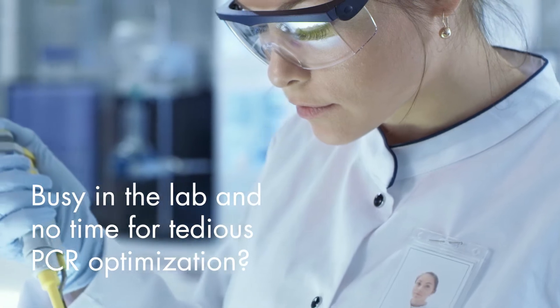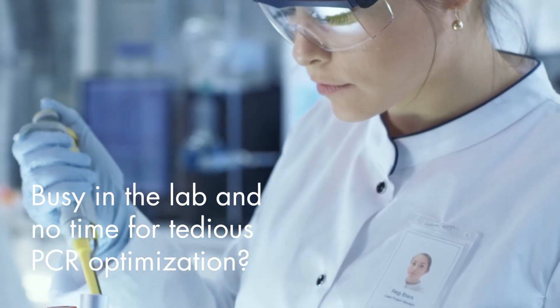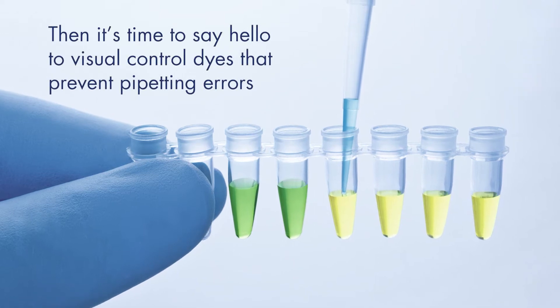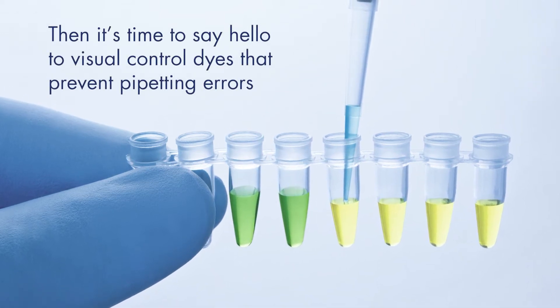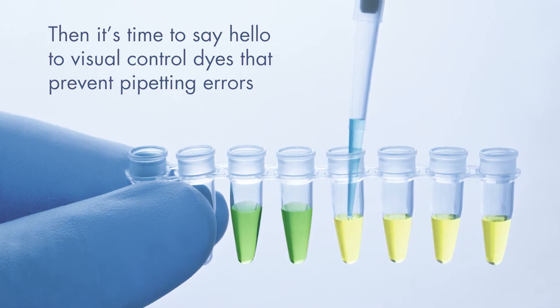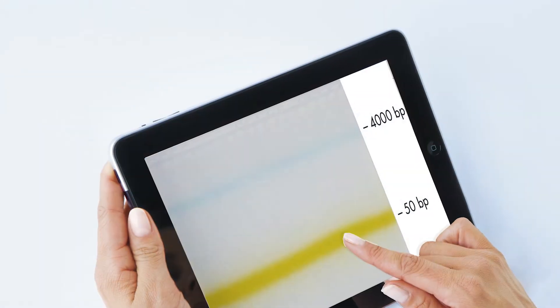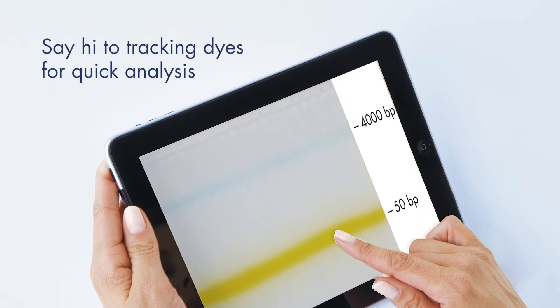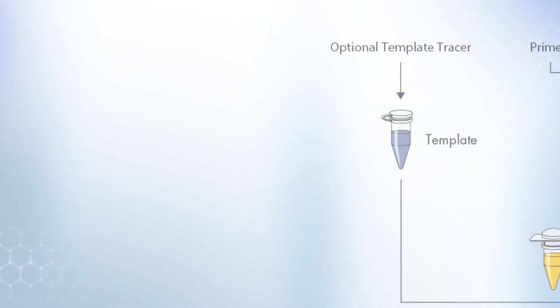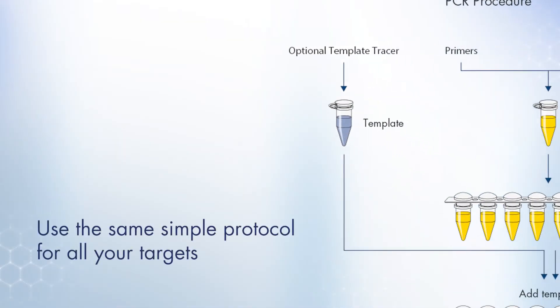Busy in the lab and no time for tedious PCR optimization? Then it's time to say hello to the extremely versatile Altac Hot Start PCR Kit, including visual control dyes that prevent pipetting errors. Our control dyes also serve as gel loading and tracking dyes.